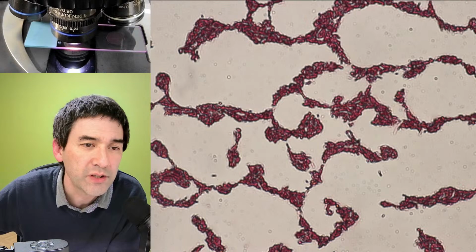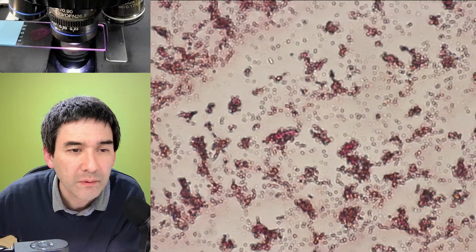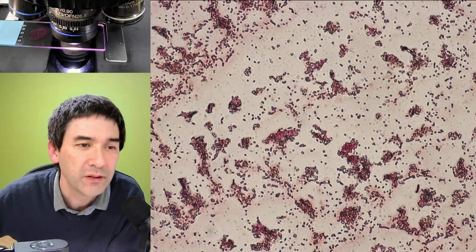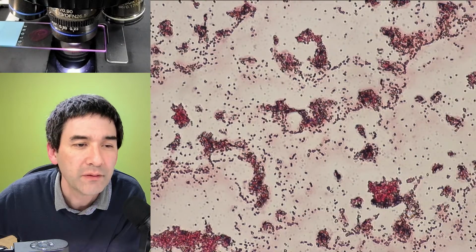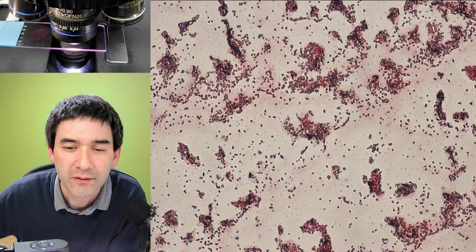Yeah, usually when they're clustered together, the color is more evident. But you do see that the shape of the bacteria is different, right? Both of them are gram negative, unless we're able to find the occasional contaminant, which I cannot find here.